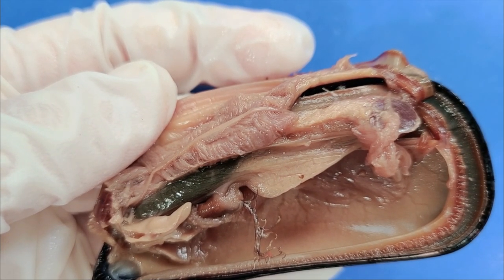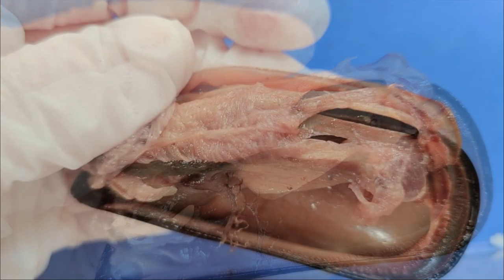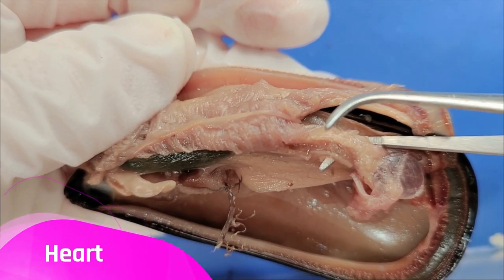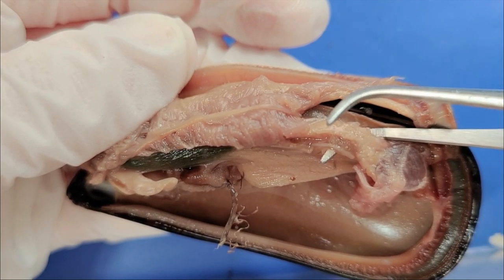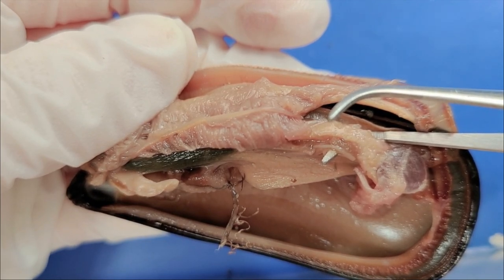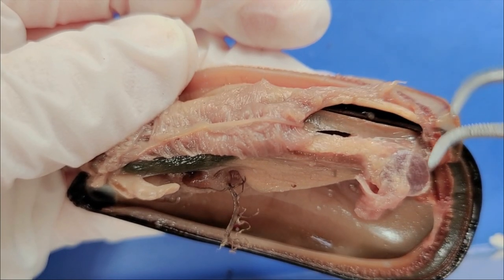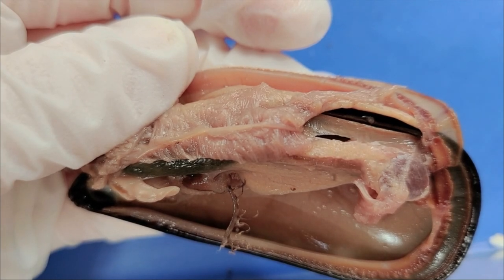The nutrients absorbed in the intestine then enter the circulatory system. Way up by the hinge here is the heart. The mussel has an open circulatory system, unlike us humans who have a closed circulatory system. An open circulatory system is a bit like a jacuzzi — the body cavity is filled with a fluid called hemolymph that sloshes around the internal organs, helped along by the pumping of the heart. A closed circulatory system is more like a system of pipes, because all the blood is contained within the system.